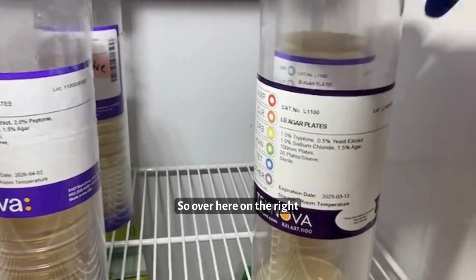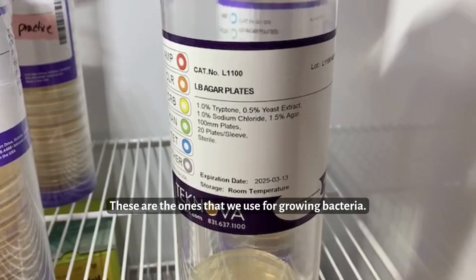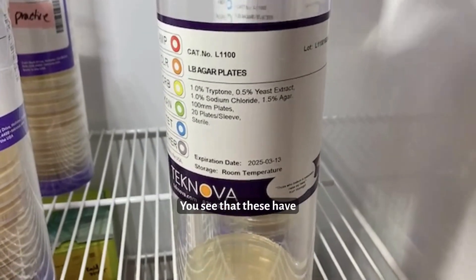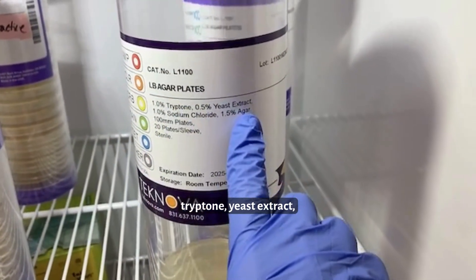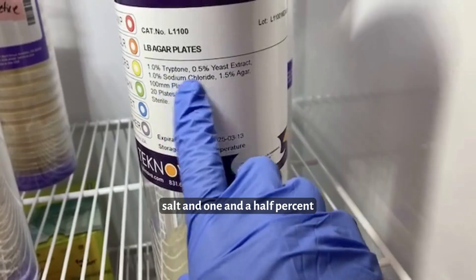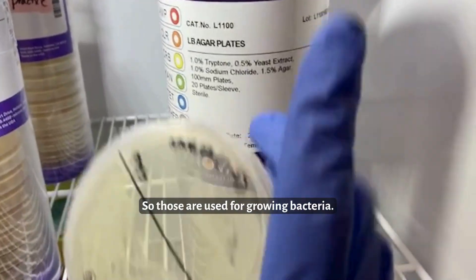Over here on the right are the LB agar plates. These are the ones that we use for growing bacteria. You see that these have tryptone, yeast extract, salt, and 1.5% agar. So those are used for growing bacteria.